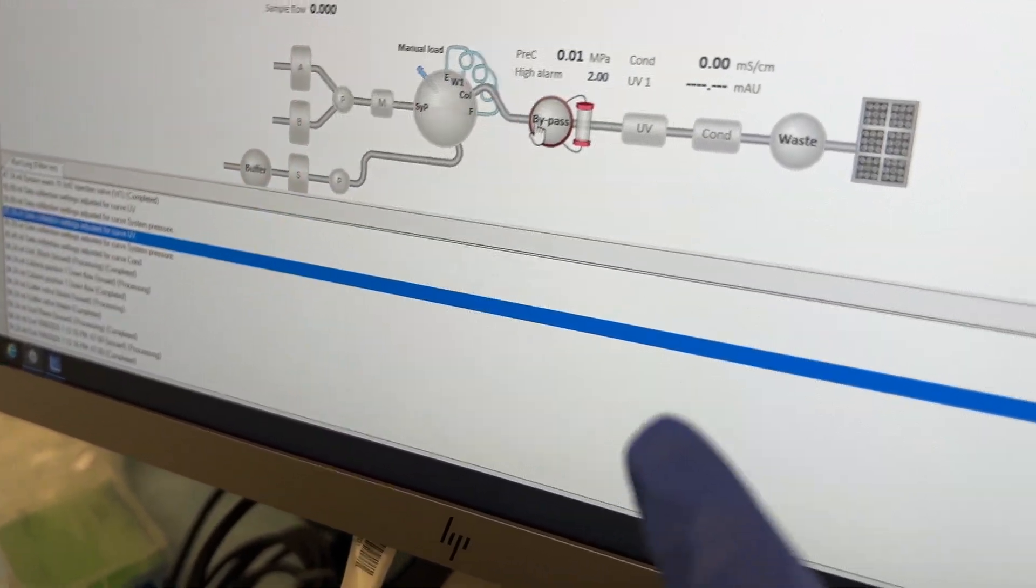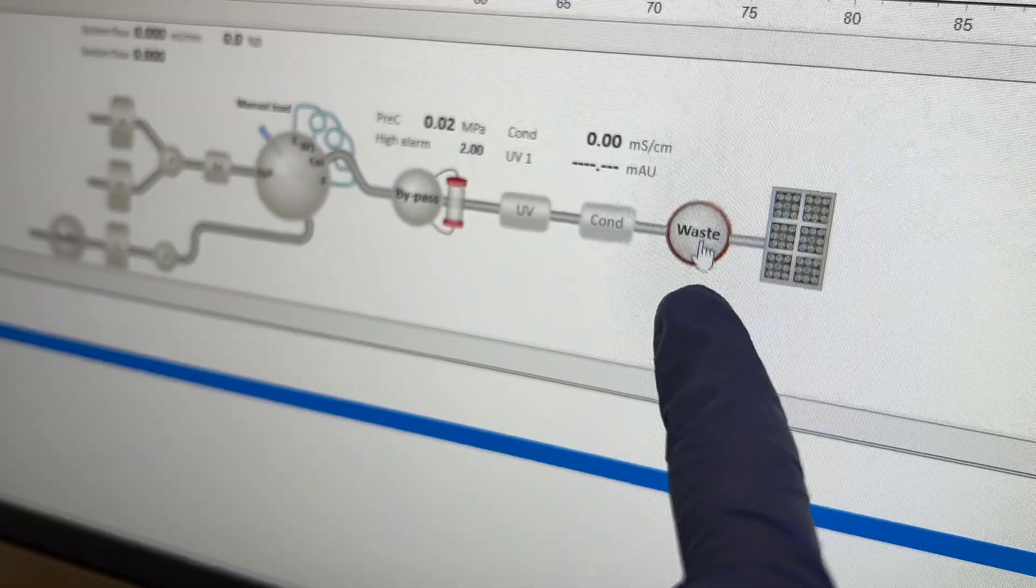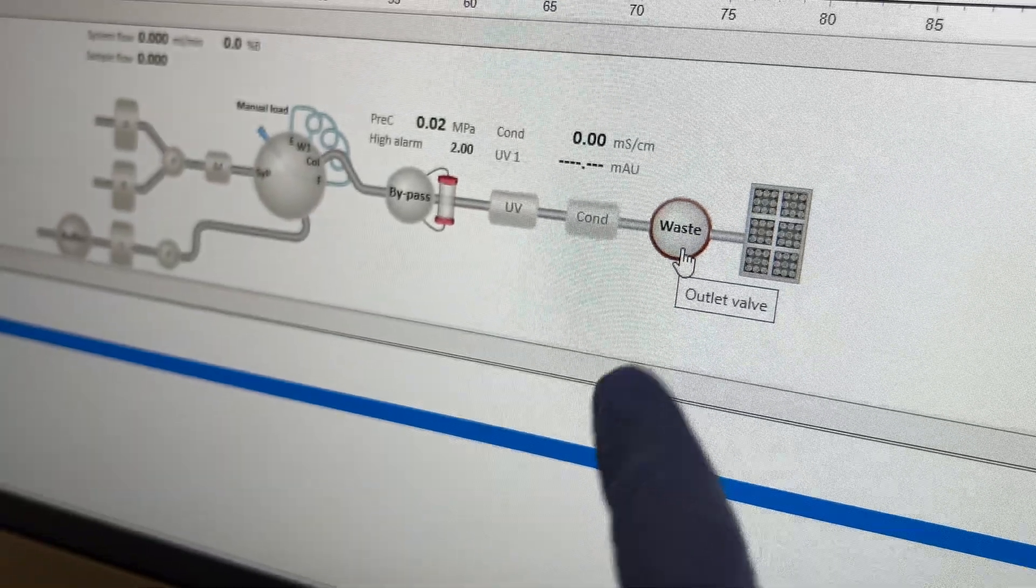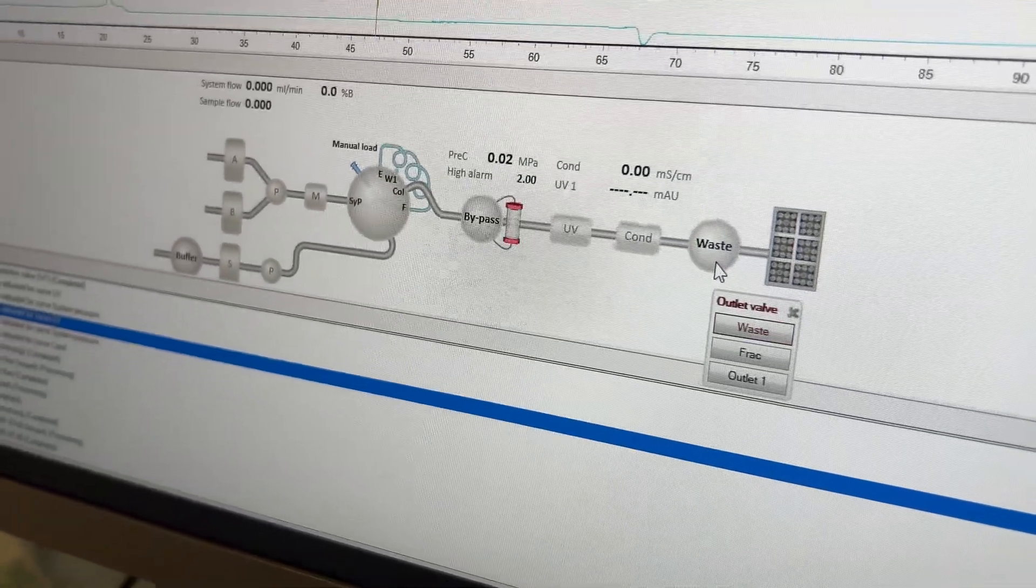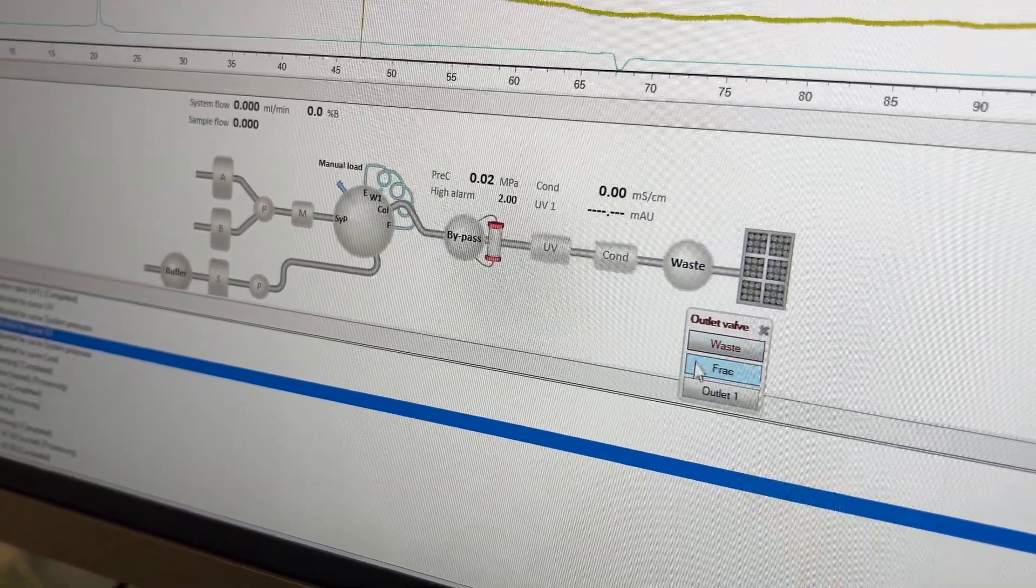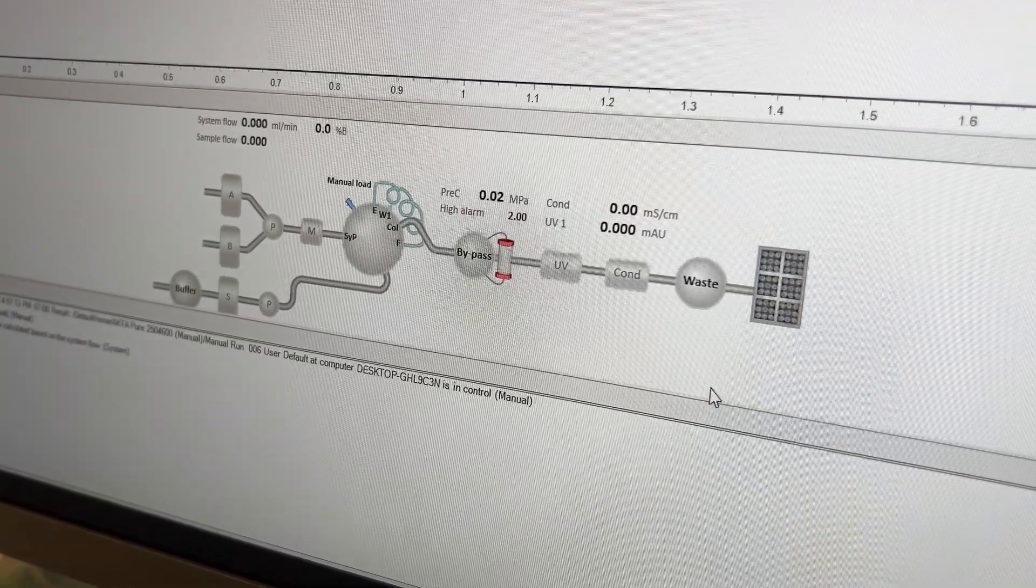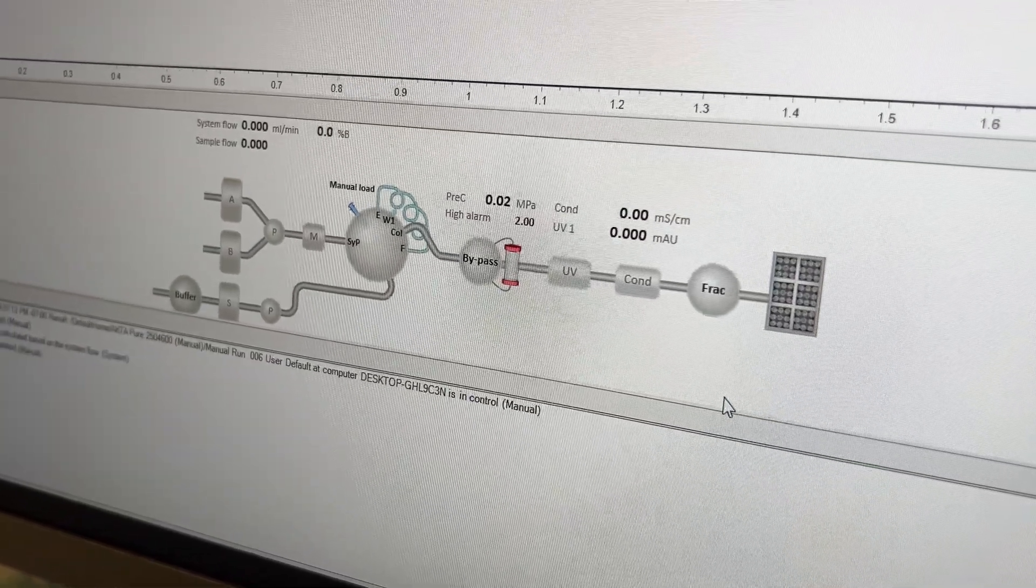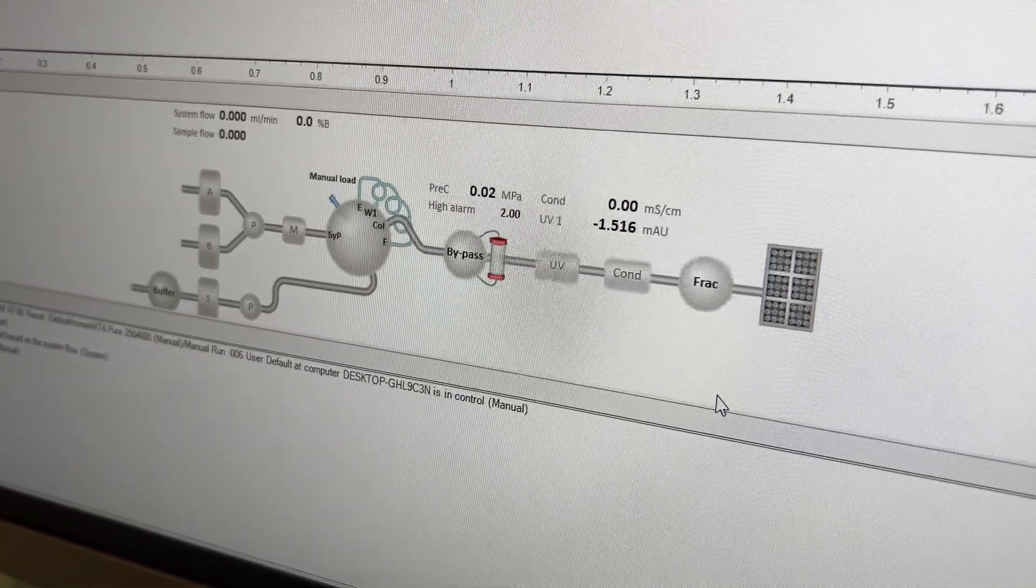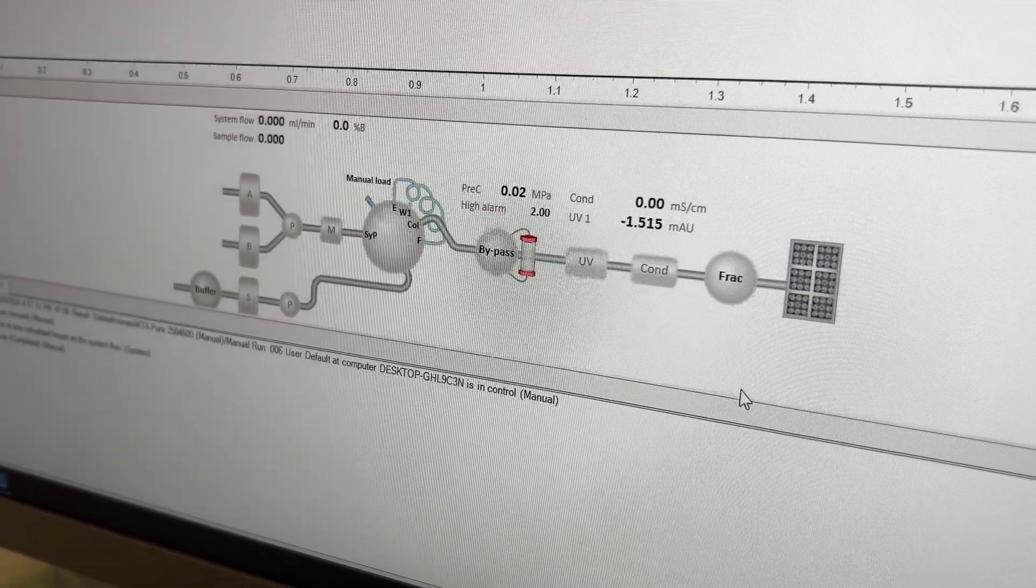So right now, if we go here, we can see we're going to waste. If you click on that and now you select Frack, there we go. And so now we can see that it's going to go through that fraction collector line.